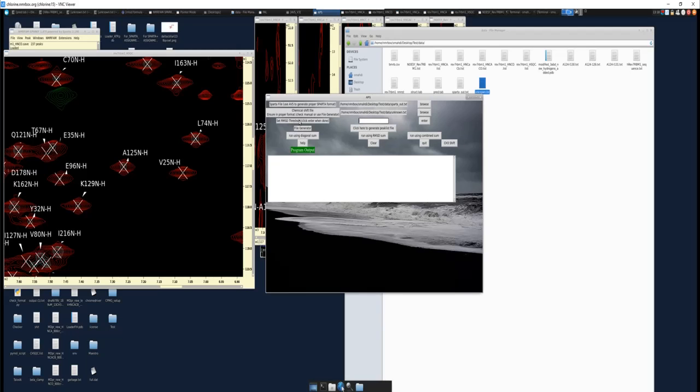This RMSD threshold basically sets a filter. It only shows you those pairs of RMSD matches that had an RMSD below the value you put. So let's put 3 for now and click Enter. And there are 2 different ways of calculating this. We're going to use the way I just discussed, where you just take the entire text file that you have and compare it to pairs of matches in the SPARTA+ file, and click RMSD sum.